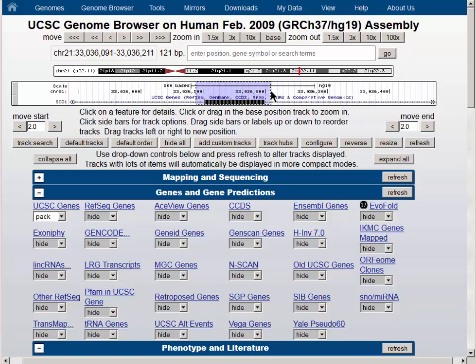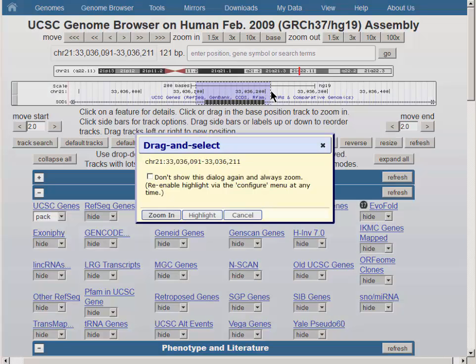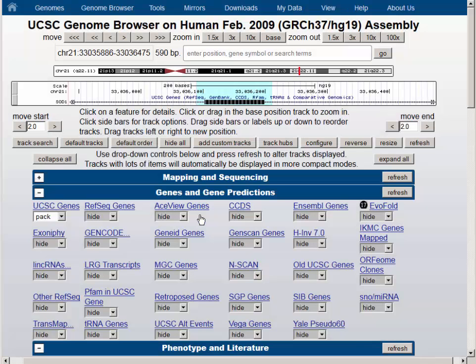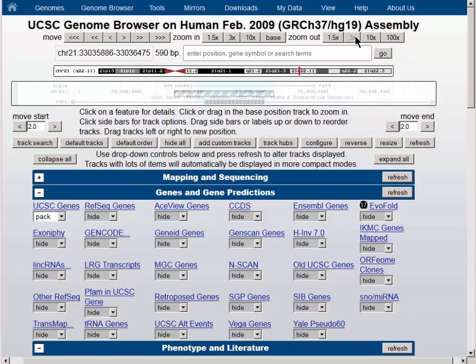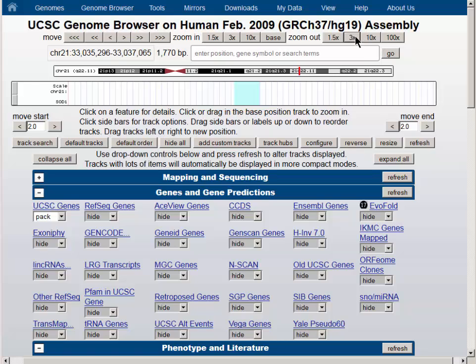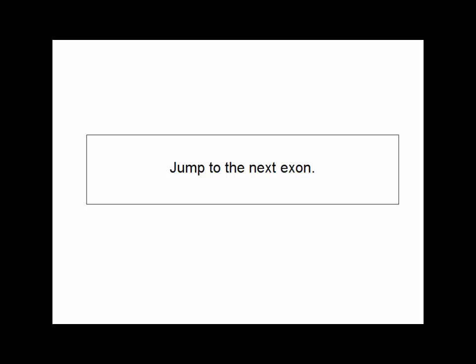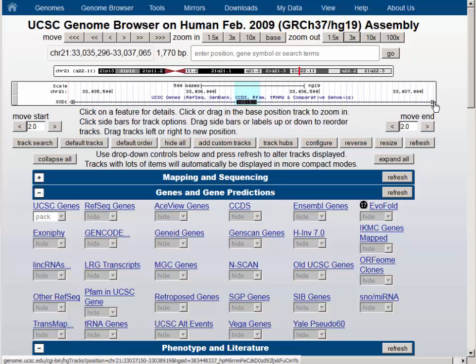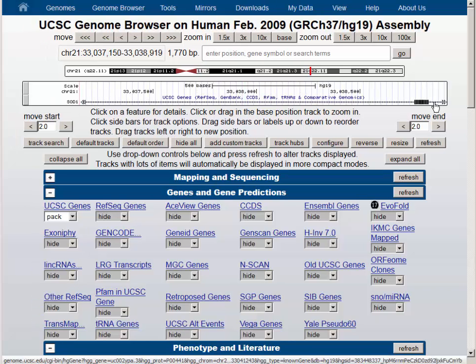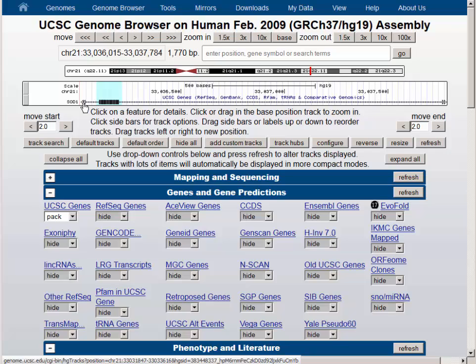We can highlight these exons as well by putting the cursor in the same configuration as before, dragging it across the top and using the highlight button. So now it's possible, for example, to zoom out and put this in the middle of the screen. Then using the right and left exon arrows, we can move to the next exon or back to the exon where we were just looking.